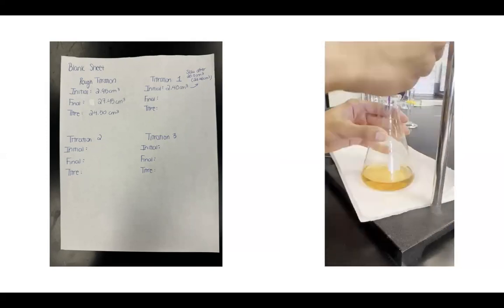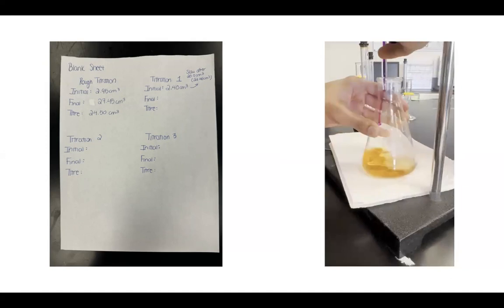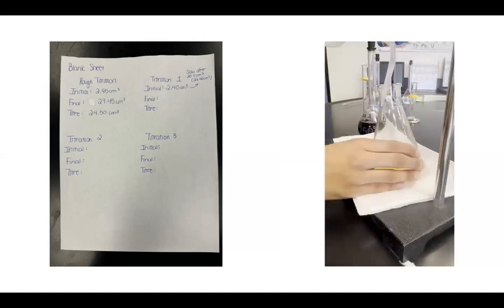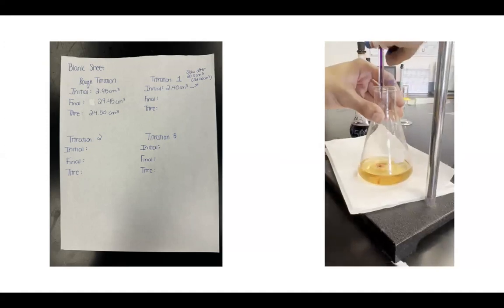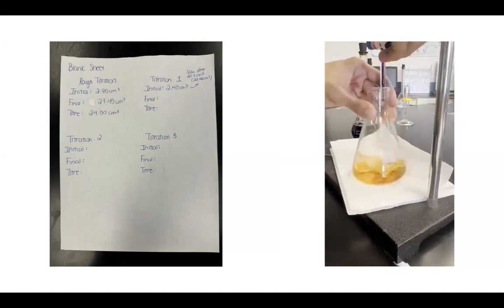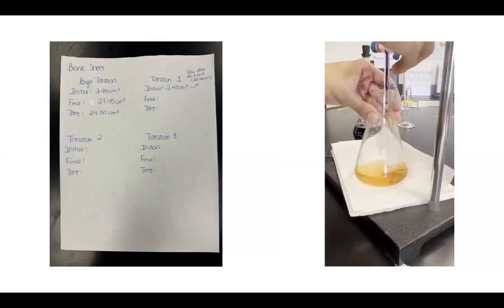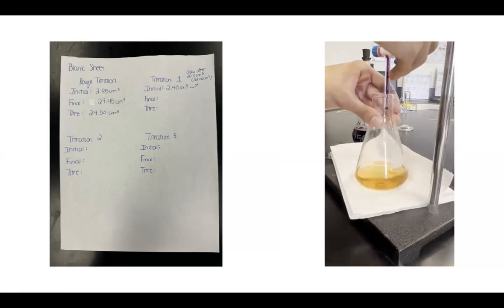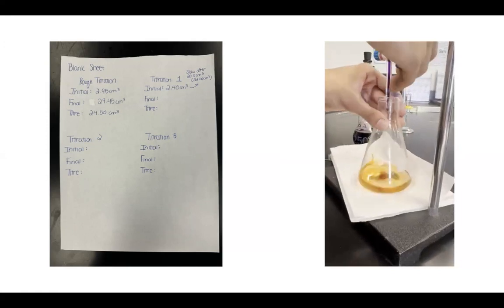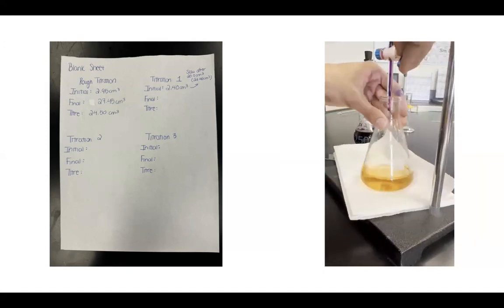The endpoint is always when it's kind of a medium between the initial color and the final color. We know the final color is this purplish color, and the initial color is a clear color. So we're looking for a pinkish medium where the colors are equal in weight. It's a little bit subjective, so just try and use your best judgment. But honestly, when you're doing this for such a long time and titrating, you just get the sense of, okay, the color has definitely changed.